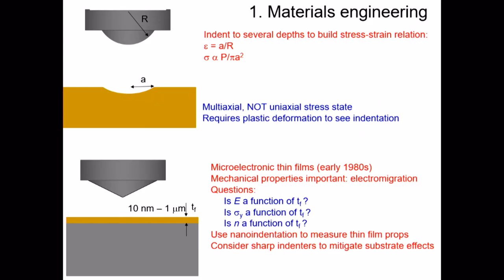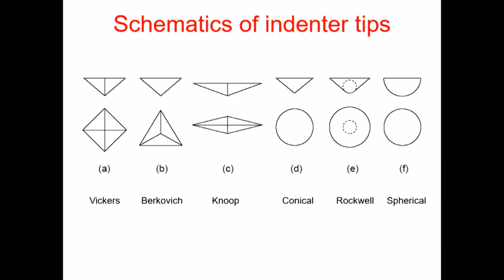This AFM which we have is coupled with indenting, nano indenting, so we can mechanically indent and see how cracks are formed and what the surface or mechanical properties are. We can have different indenters, Vickers indenter, Berkovich, Knoop, but we have only Vickers and Knoop indenters in our machine, and we study the mechanical properties of a material using this, coupled with AFM.